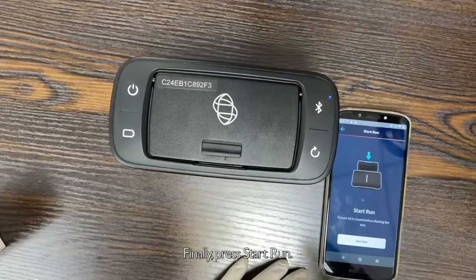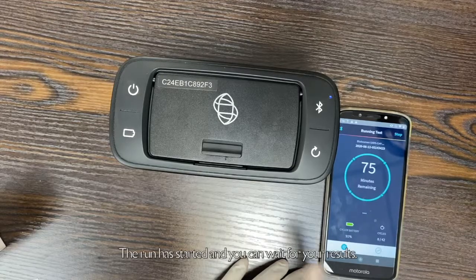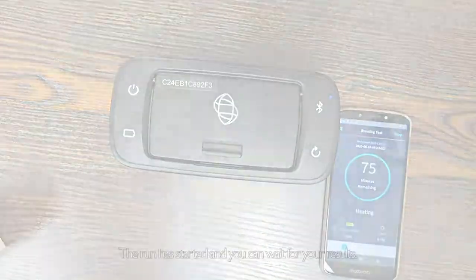Finally, press Start Run. The run has started and you can wait for your results.